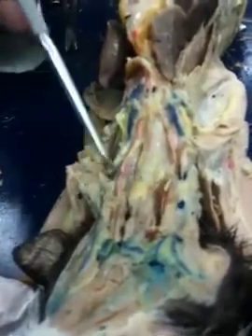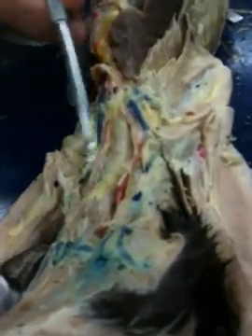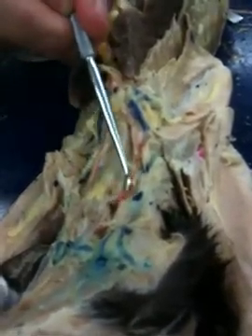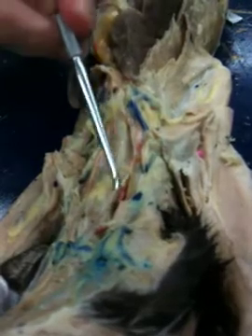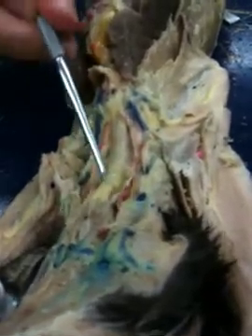Okay, I'm not seeing your thyroid gland at all. I cut it out? I don't know, I'm just asking. You may have, I don't know. But the thyroid gland usually sits right here and right here. Is that it? Nope, that's a muscle. You may need to clean that out a little more to get that fat off there to find it. Whenever they get out their cat again, they had pretty good thyroid glands.